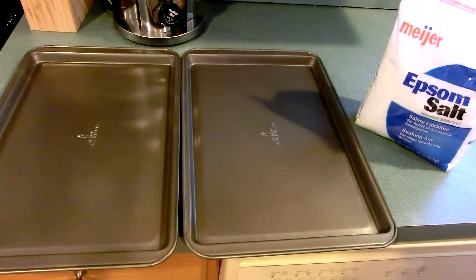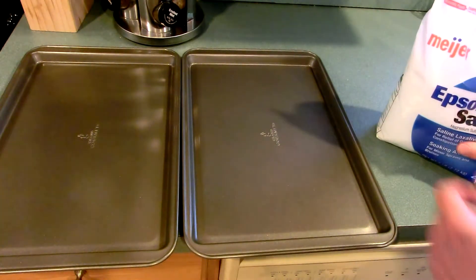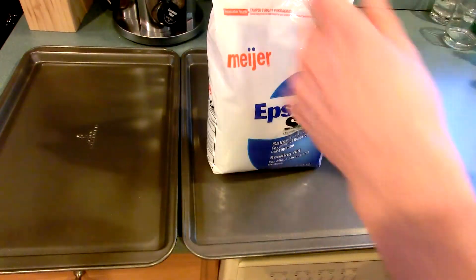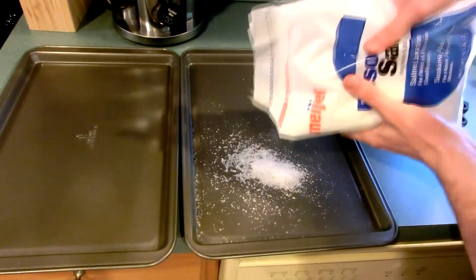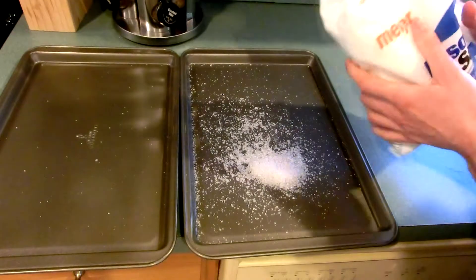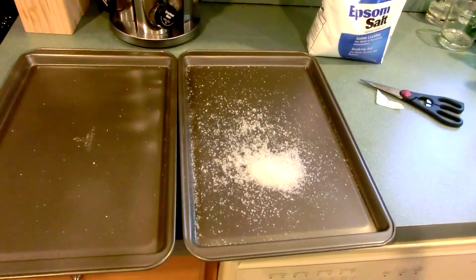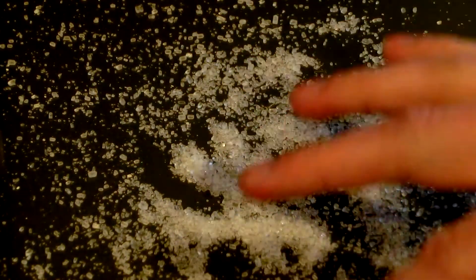So what we're going to do is simply open this and spread it out evenly onto the pan. I'll give you a closer look at the crystal structure — you can see they're very large crystals, very clear, very large crystals.